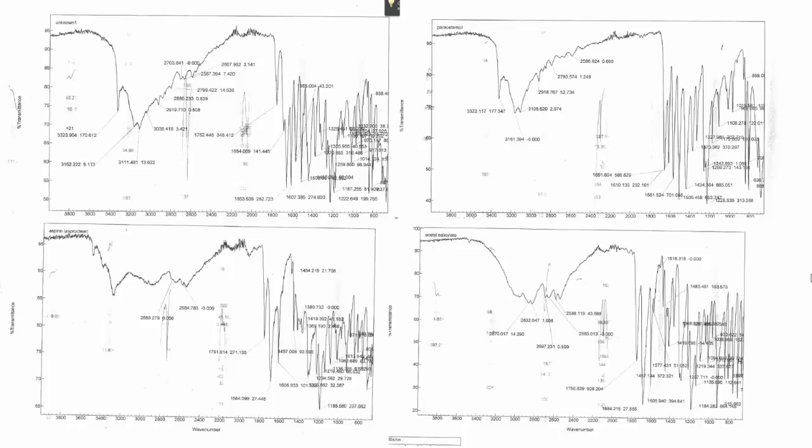Unknown 1. By analyzing the IR spectra of this unknown, we were able to identify various functional groups which corresponded to the peaks from the characteristic IR spectra. We were able to deduce from the IR that the unknown compound contained paracetamol. This conclusion arises from identifying that the peaks at 3323 and 1653 correspond to the NH bond and the CO bond, amide bonds.